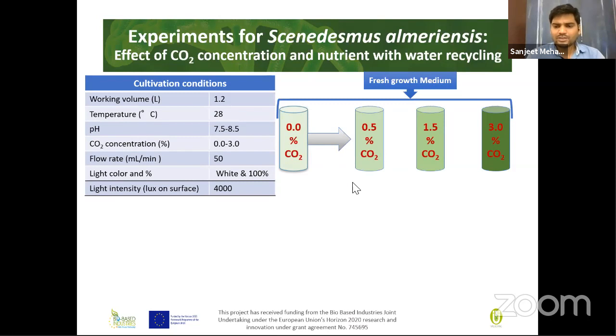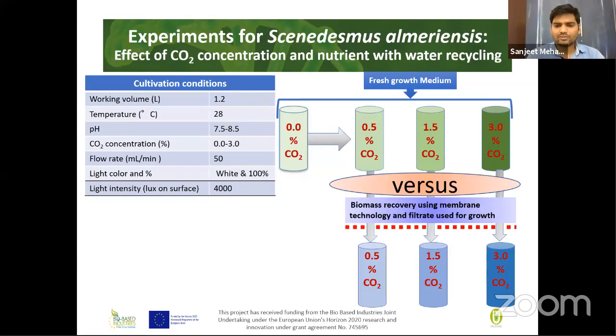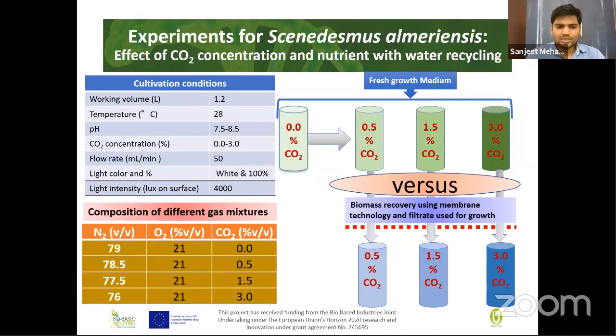And this is the first phase of growth. In this growth phase, we harvest the biomass using membrane technology. After harvesting the biomass, we use the filtrate for the secondary growth with the addition of inoculum. And we analyze the effect of the water recycling approach on the biomass and bioactive compound productivity. This was the gas mixture which we used for our laboratory scale system.